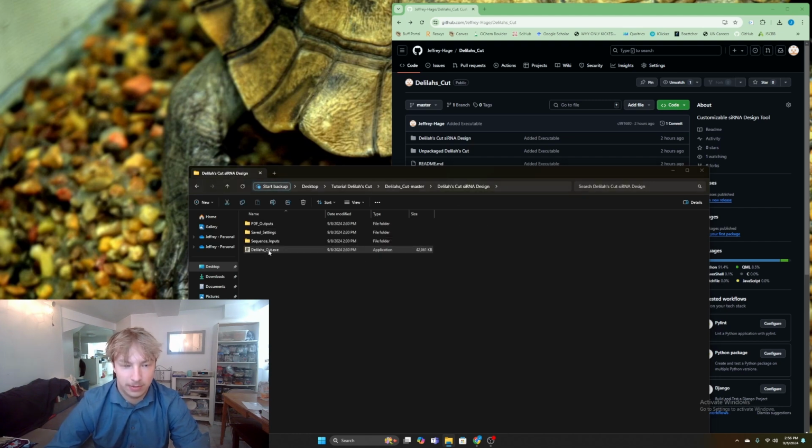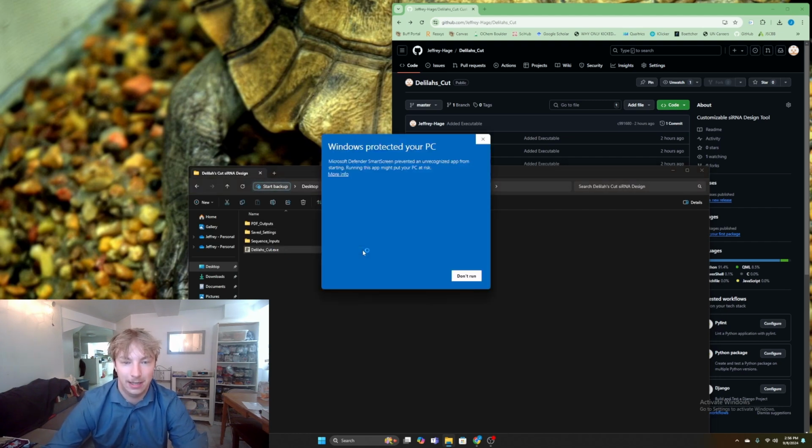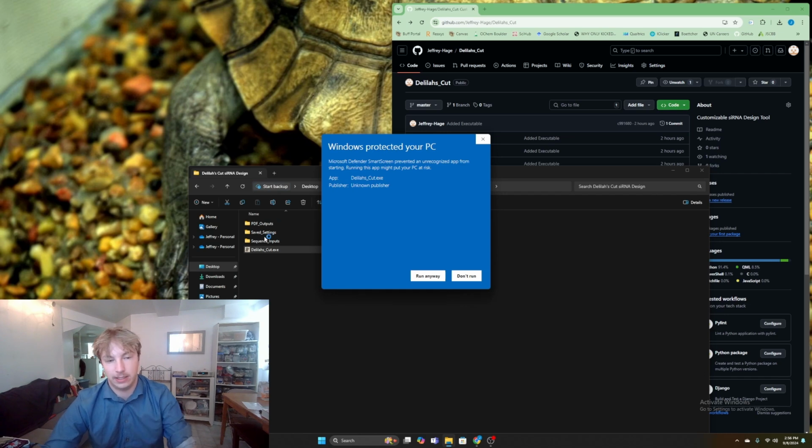But all you have to do is double click to open this. And then, all of a sudden this pops up, and this could happen because it's interacting with these files, but I assure you it's pretty safe.